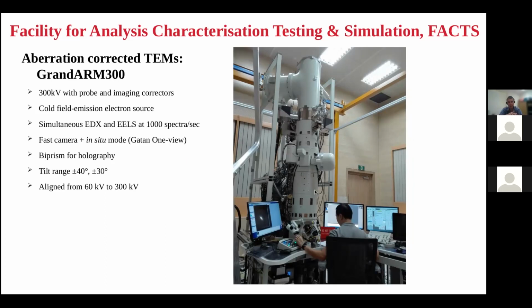So it means we can have some plane wave illumination going through your specimen, and we can look at the modulation of the wave as it goes through the specimen, and then record the plane wave image. So we can do both in this type of advanced TEM. It has basically all the options that you may need to do TEM characterization. You can do some spectroscopic imaging. You can do some electron energy loss spectroscopy. You can do some electron holography. It means that you can record both the change in amplitude and the change in phase of the wave when the wave is coming through the specimen.